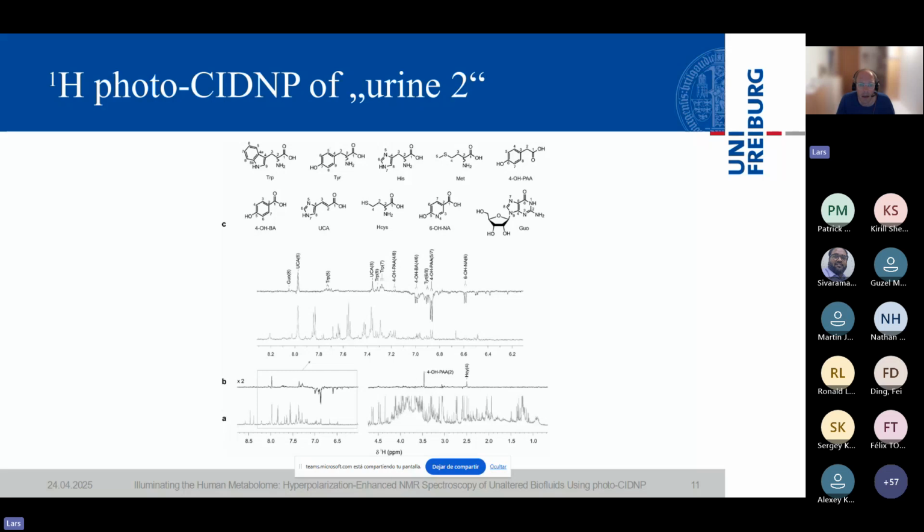And we found aberrant physiological states that are indicative of either an up or a down regulation of those metabolites in human urine. And as such, and at least as far as the future of this method, if there is a future, who knows, is concerned, we think this has quite a bit of potential, at least as far as targeted analysis is concerned. So for those of you who don't know about this, in targeted metabolomics, you know about the candidates you're looking for before you start the analysis, whereas in an untargeted analysis, you just look at all the metabolites available in the mixture.